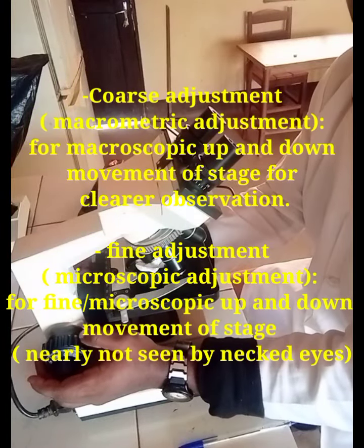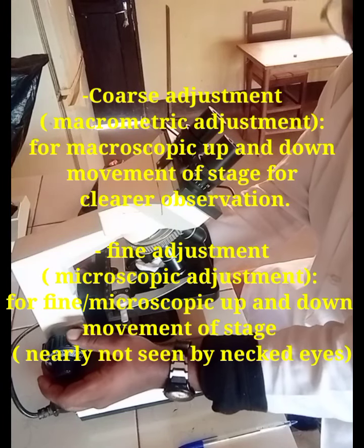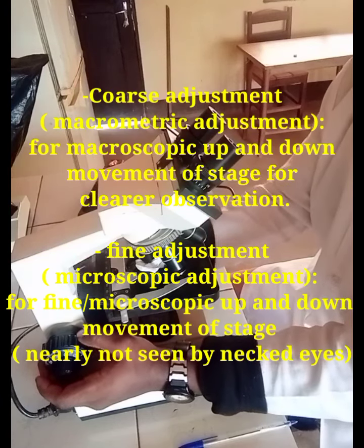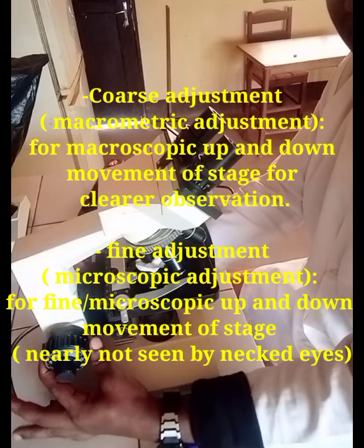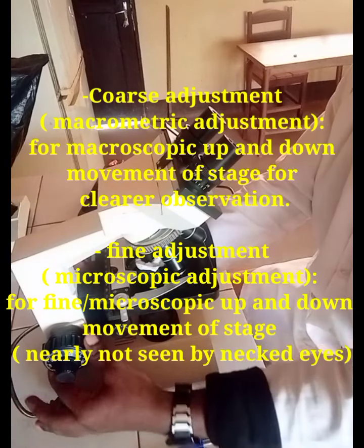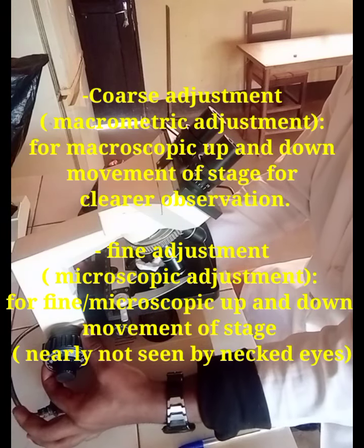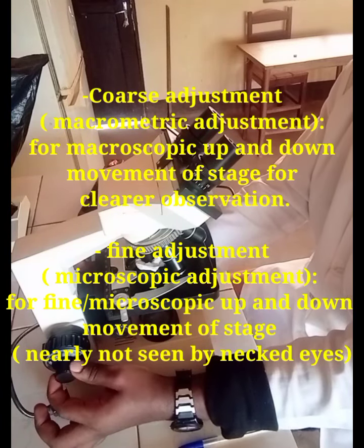Now, at the level of the handle or of the arm of the microscope, we have what we call the coarse adjustment or the macrometric adjustment. Macro for large. This big round structure which I'm moving is the macrometric adjustment. And just close to it, just attached to it, is the micrometric adjustment. Note this. This is macro for large. This is micro for small. You can also call it the fine adjustment.